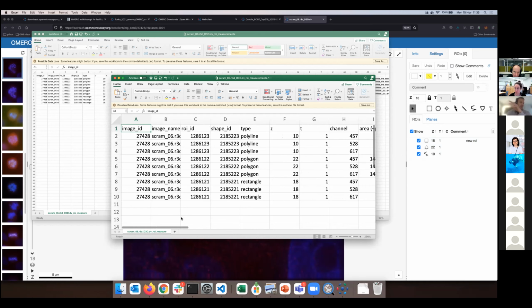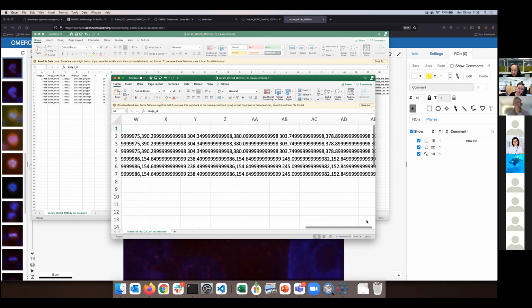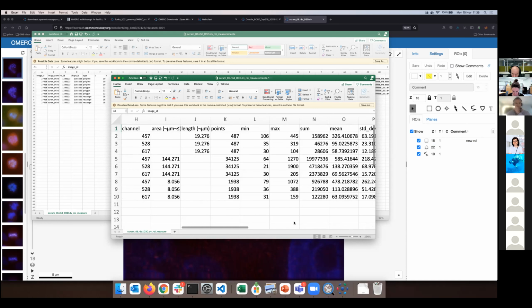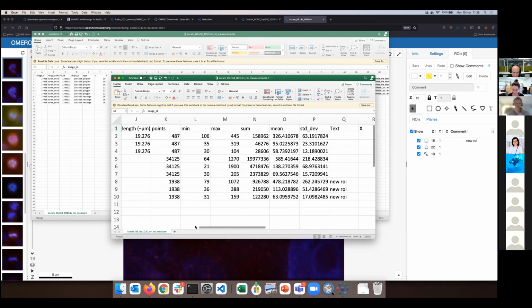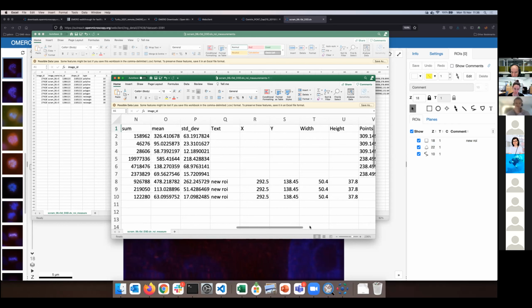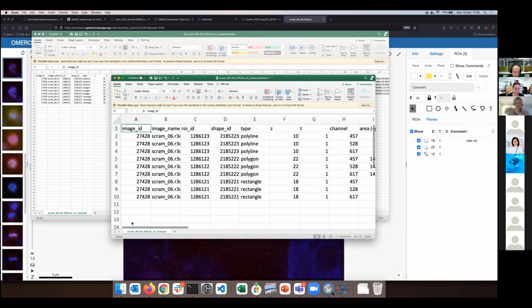So if there is an urgent need to review that, then we can do that, obviously. So the balance here is, I'm just showing you the file as it is, and what you see there, that's what you get. You might want something else. You are probably expecting something which Fiji has, and this would be something like defining the columns in my measurements table. But my recommendation in this case would be simply use Fiji.